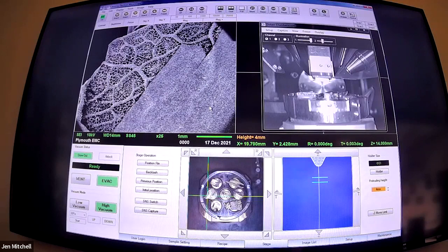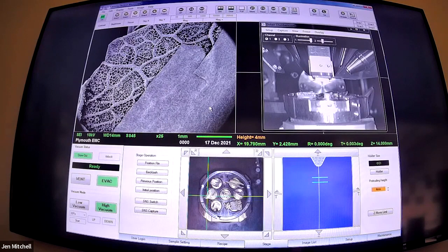Paula sent a question in the chat: does moisture in the object affect image quality? Yes - putting wet things into an electron microscope is not a great idea. They tend to bubble, they damage, they outgas a lot. What we try and do is put everything in as dry as possible. So we freeze dried these leaves, which also means we can then break them apart and get these nice crisp images. Putting wet things in an SEM doesn't work particularly well.